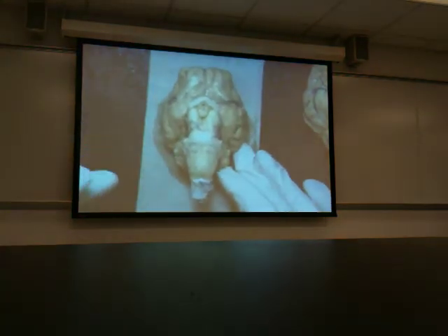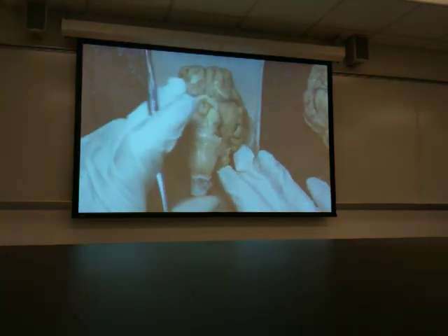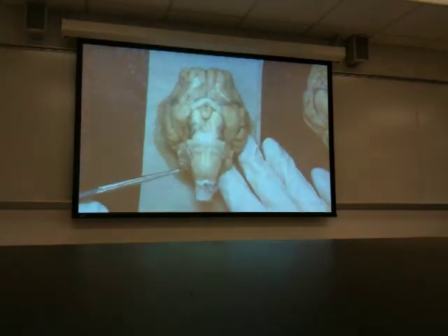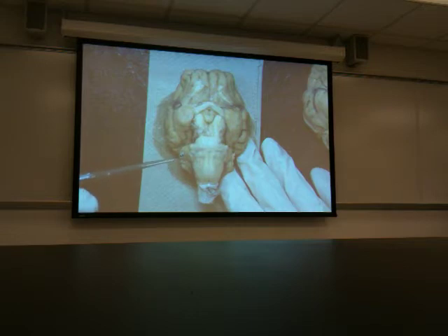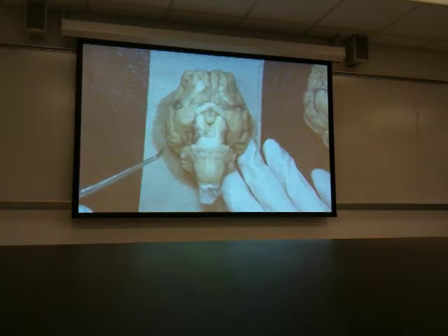The reason this one is so good, and you can see the ridges so well, is somebody in dissecting this pulled off the arachnoid. Now, I don't know if that's mentioned. The meninges are mentioned as your identification structures, but are they? Because you have to identify the arachnoid and the dura mater. You don't have to identify, as far as the 3 meninges are concerned, the pia mater. Okay, Ariane, I don't even see your face, so you just speak up if you need me, all right? Fusan, I'm kind of the same way, like this. All right? Arachnoid and dura, you said? Arachnoid and dura mater, you're going to have to be able to identify.